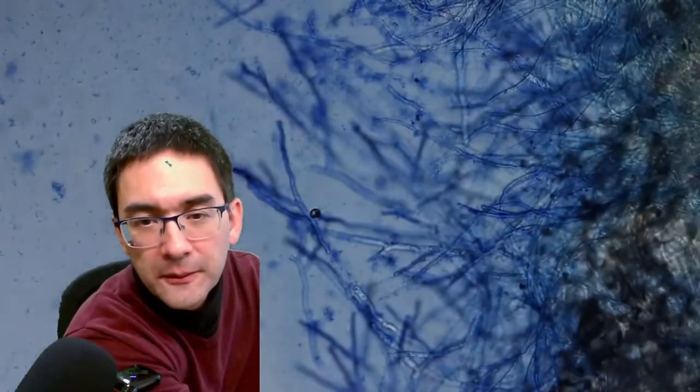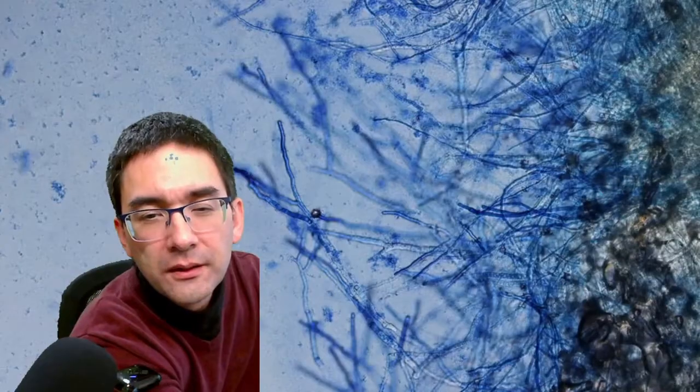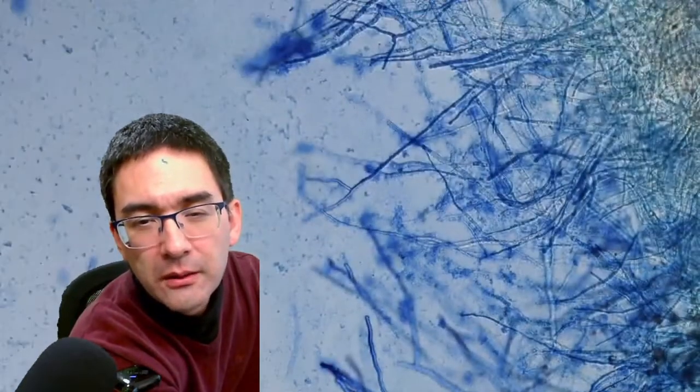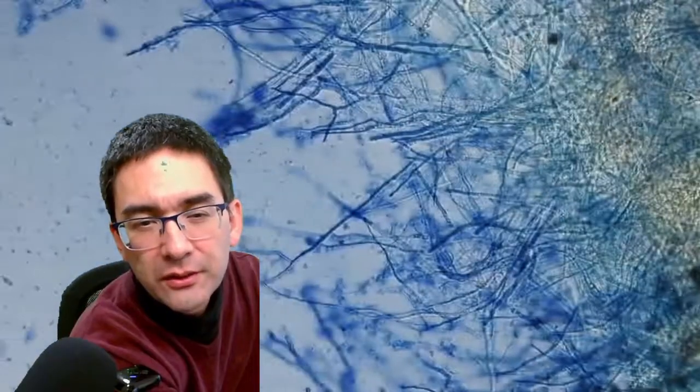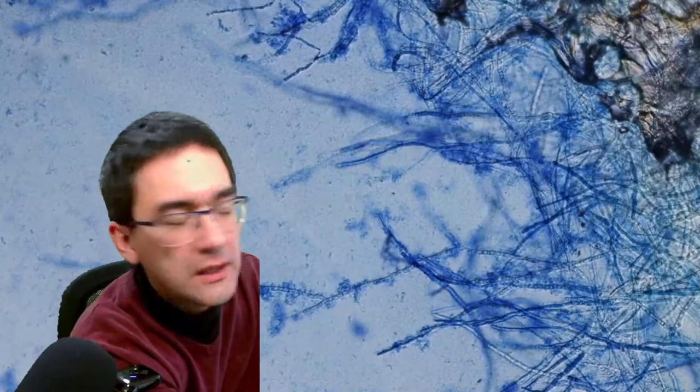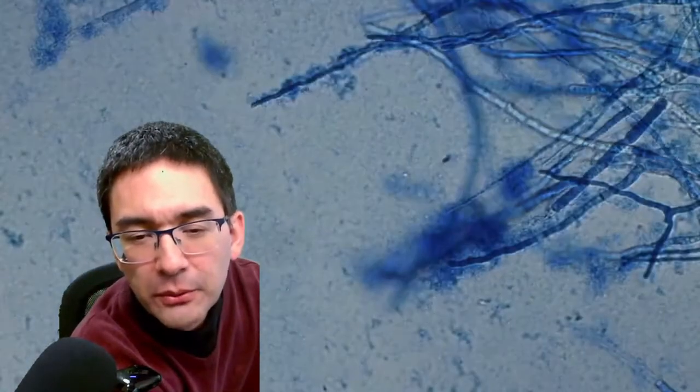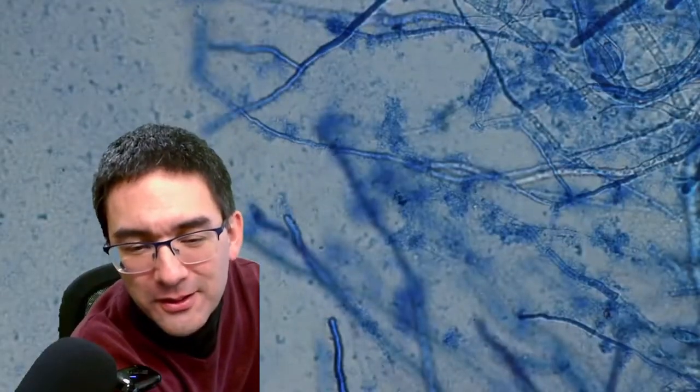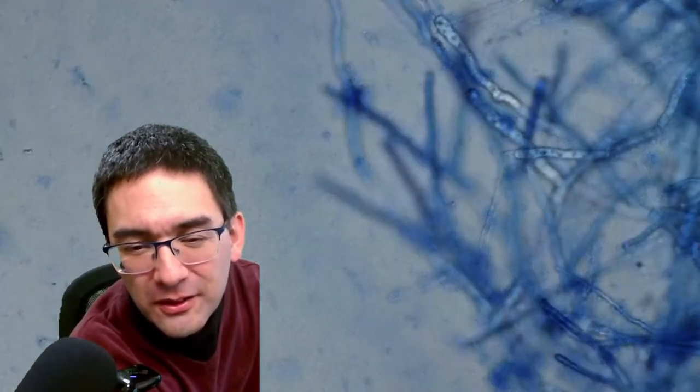Then let's go back to the microscope view and let's see what we're able to find here. So this is again, here we go. You can see that the cells start to stain blue. Over here towards the center it was not able to reach it yet, but the cells here stain blue. Let's go up a little bit now. From 20 to 40. Here we go. So that's the advantage of methylene blue, it likes to stain pretty much anything. So also known as the microscopist stain because it's an easy-to-use general-purpose stain that you can use.